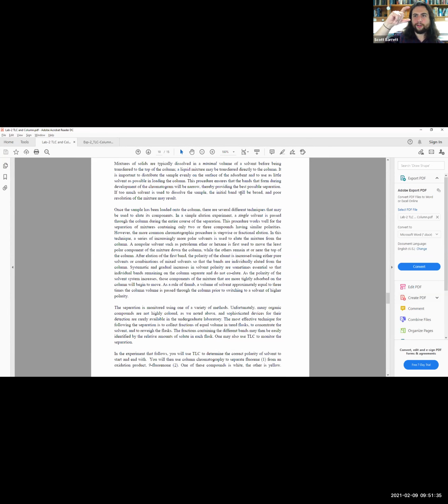And then all of a sudden you have a big band moving through your silica gel, and some of it will attach more and you'll get separated. The idea is to keep it uniform so that it moves uniformly through your silica gel, and not this massive amount where one part is going and another part is crossing, and you have a very mixed separation. So you'll want to reduce the amount of excessive solvent that you utilize within your compound mixture that you place on top, so that you get a very nice uniform separation.